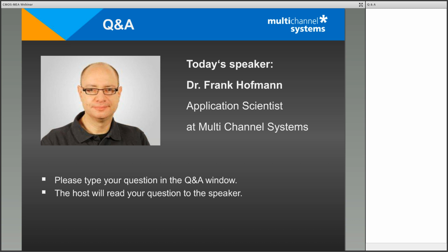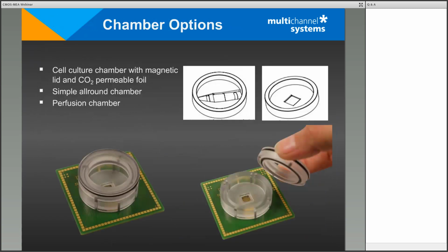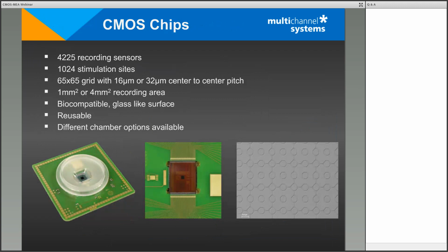If you see that image, over here you can see it. So if this is 8 microns, the recording spots, well, they are much larger. And we found that it's usually not effective to use only one of them, at least in retina preparations. I didn't do extended tests in cell culture so far.